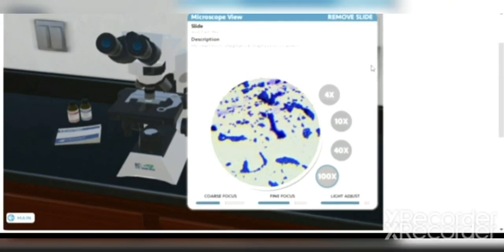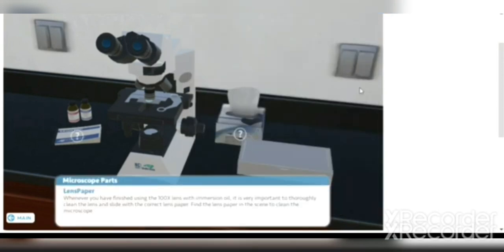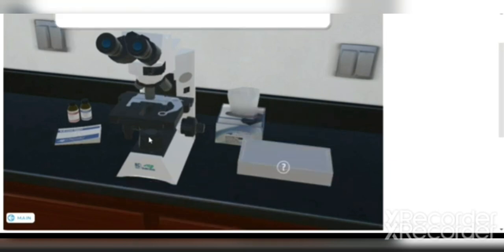When you're finished with the microscope, use the coarse adjustment knob to bring the stage all the way back down. Rotate the objective lenses halfway so that they are out of the way. Then, remove the slide. To clean off the immersion oil lens, only use lens tissue paper. Any other type of paper could scratch the objective lens. You also never want to touch the lenses with your fingers. Oils from your hands can smudge the lens and could potentially scratch the lenses.